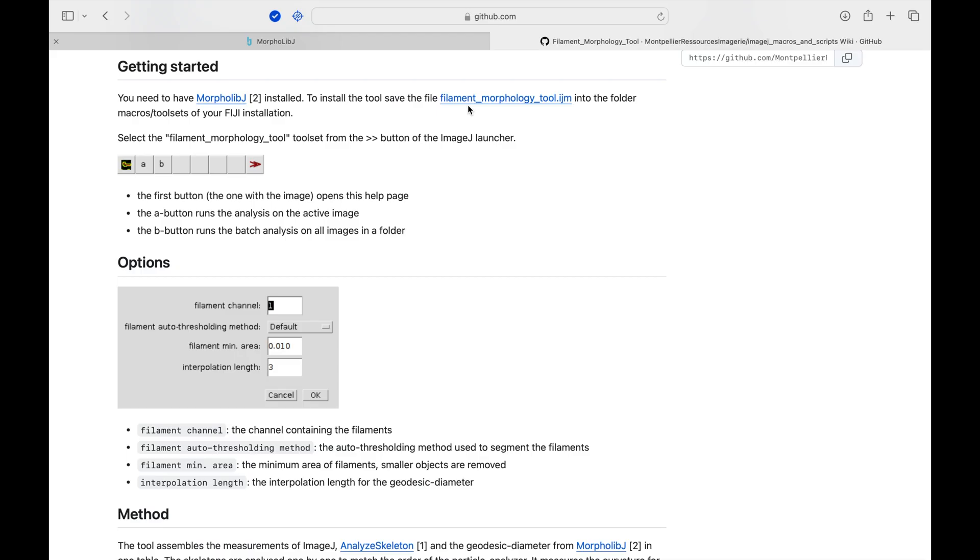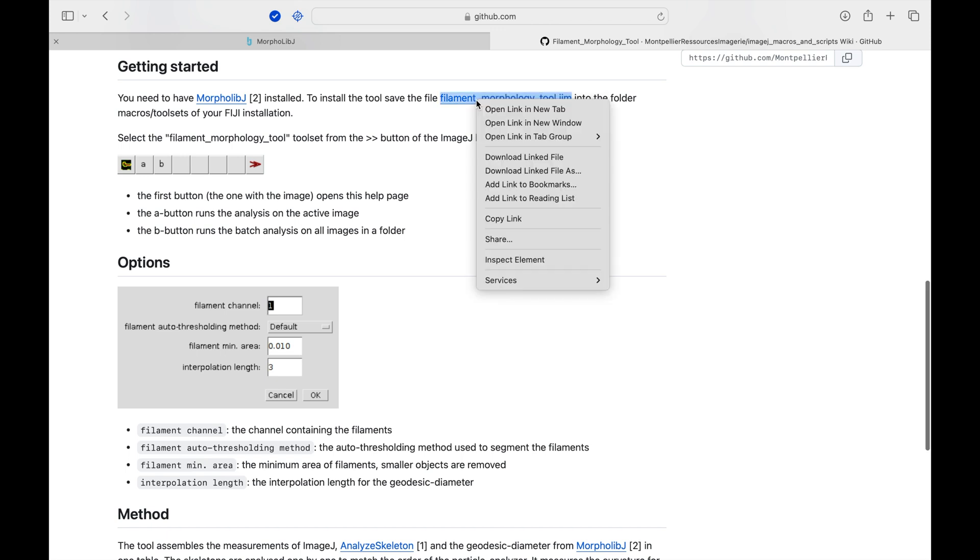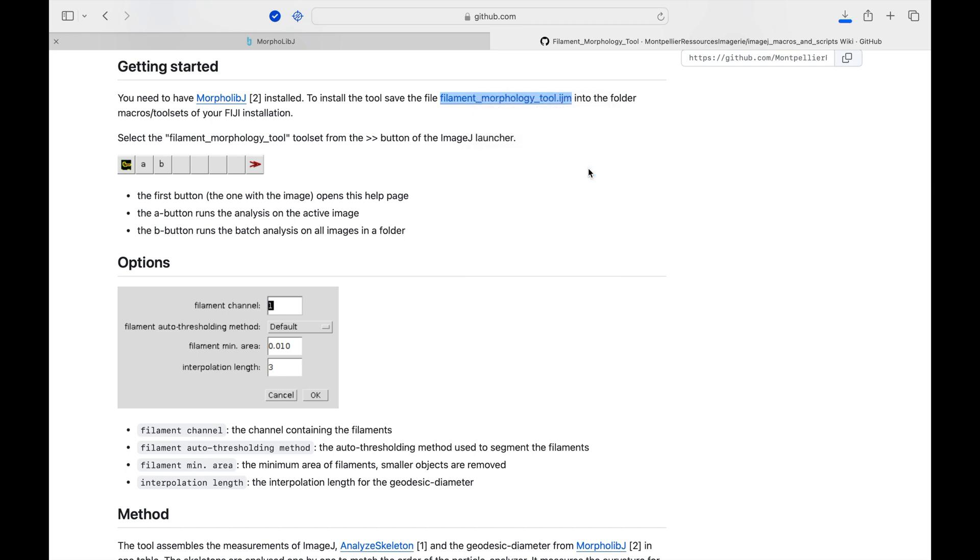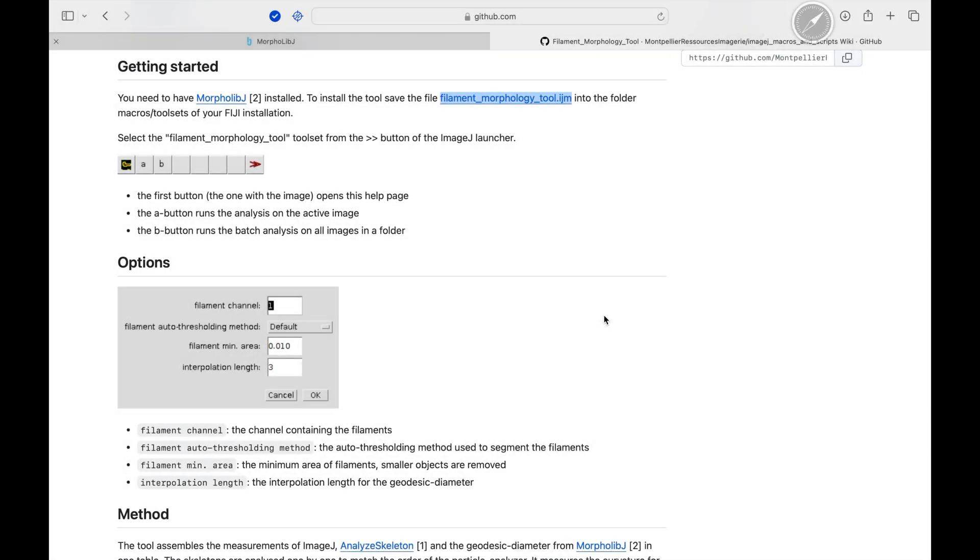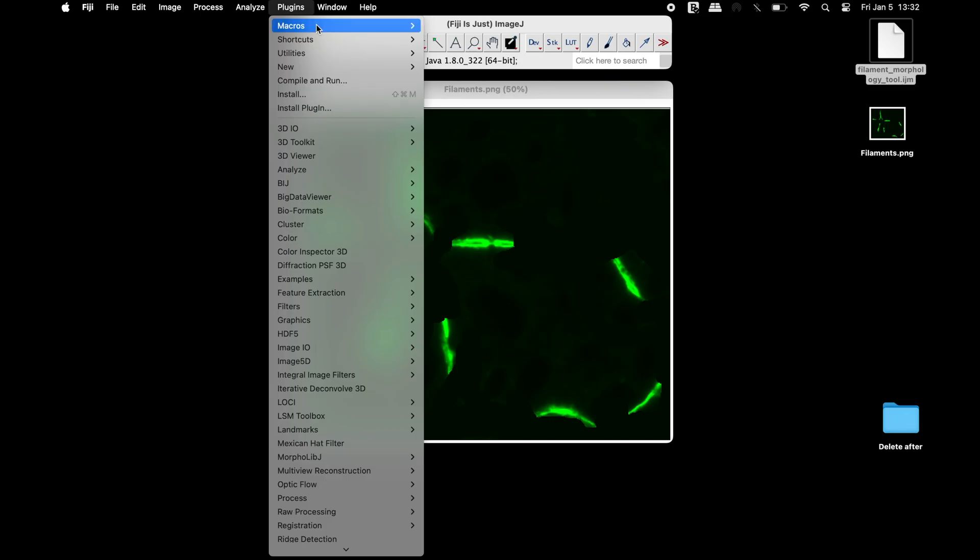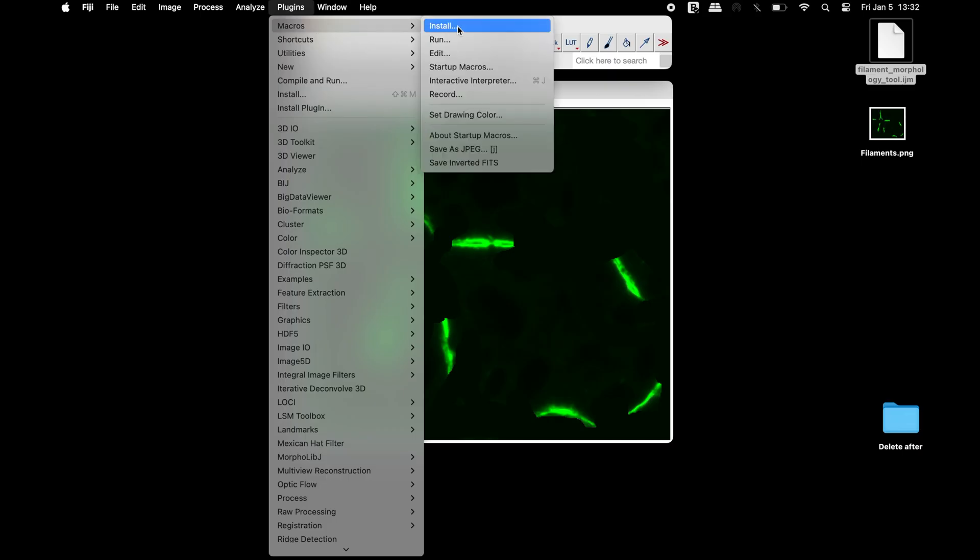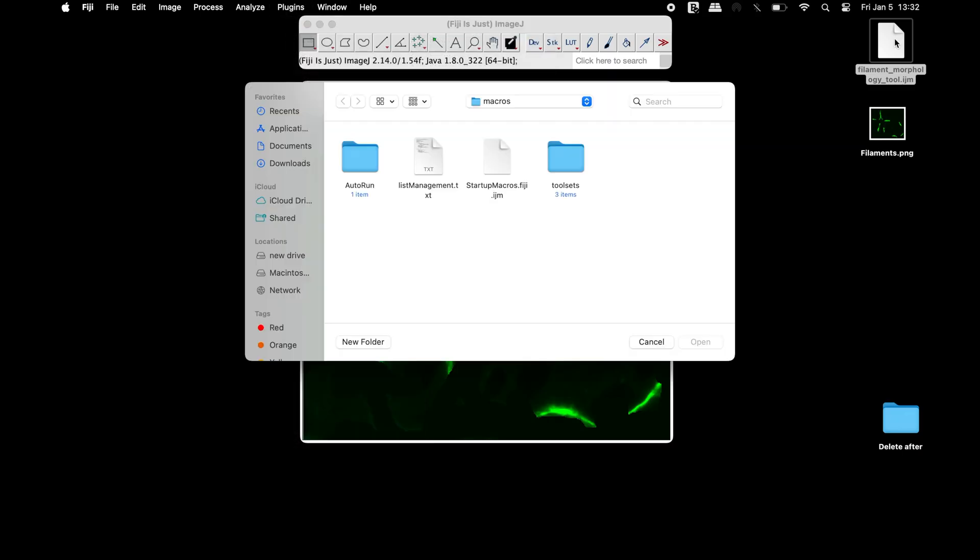The macro that is required to analyze the morphology of filaments is the FilamentMorphologyTool.IJM. Download and install this macro in Fiji. After installation, a restart of Fiji may be needed.